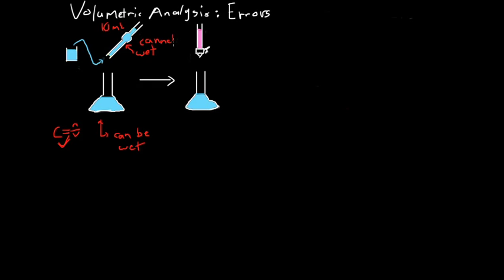Another source of error, somewhat obviously, is if we don't fill the pipette to the right level. If we under- or overfill the pipette, then we're going to have more or less than 10 milliliters of solution. That's going to affect the number of moles of solution we have in the flask, which will affect our final calculation for the concentration of the unknown solution, no matter whether the burette or the pipette contains the unknown solution.